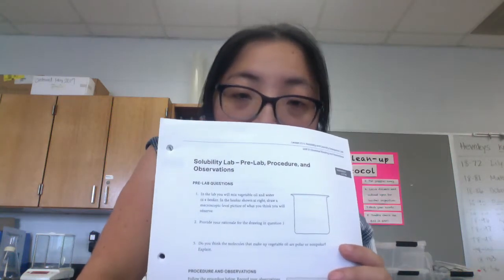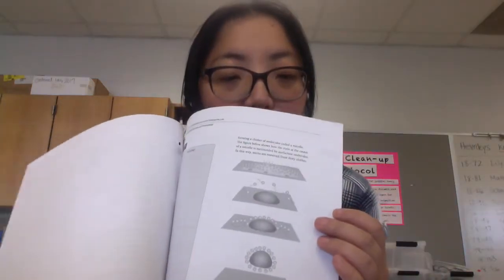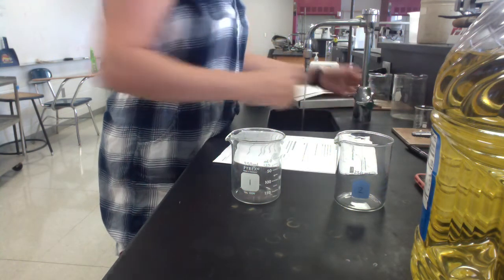So today we're going to be doing the solubility lab. This follows 2.11, which you did the reading for yesterday or earlier today. This reading article follows into this lab. So let's get started.